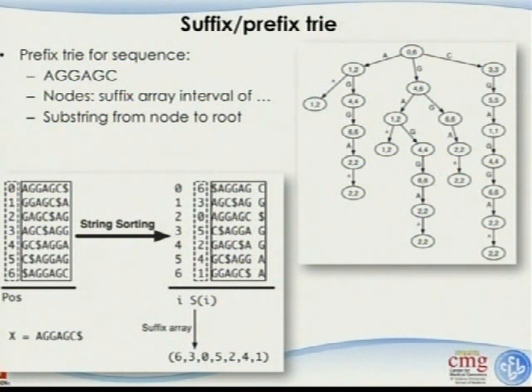All right. So what happens here is this becomes your reference genome. Okay? It's weird, I know. So you have a reference genome, which is 3 billion letters, and you can generate a huge, huge tree that represents this reference genome. I'm not going to tell you how to generate that tree, it's complicated, but it's doable. But the point of this is searching becomes very, very fast.